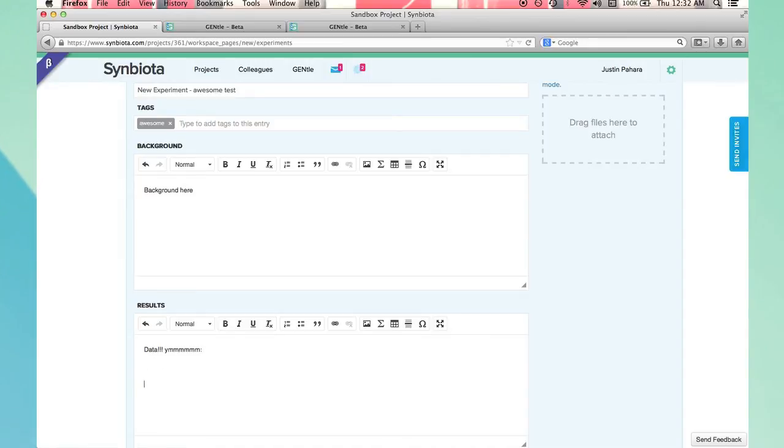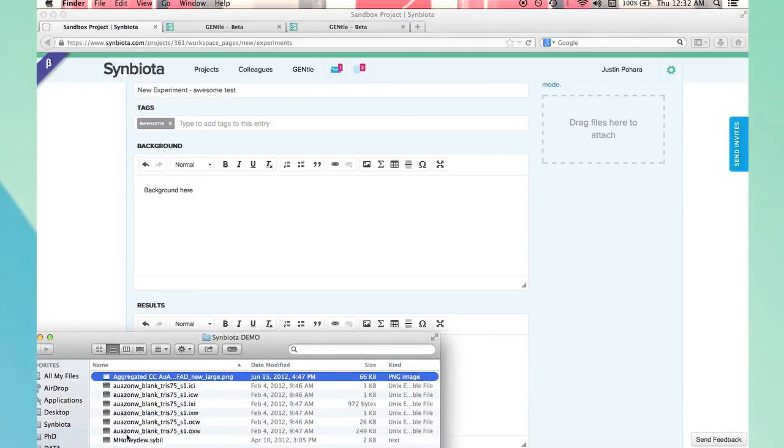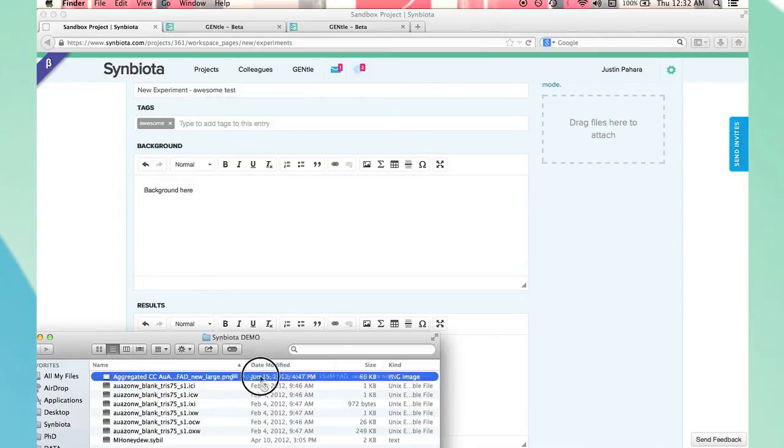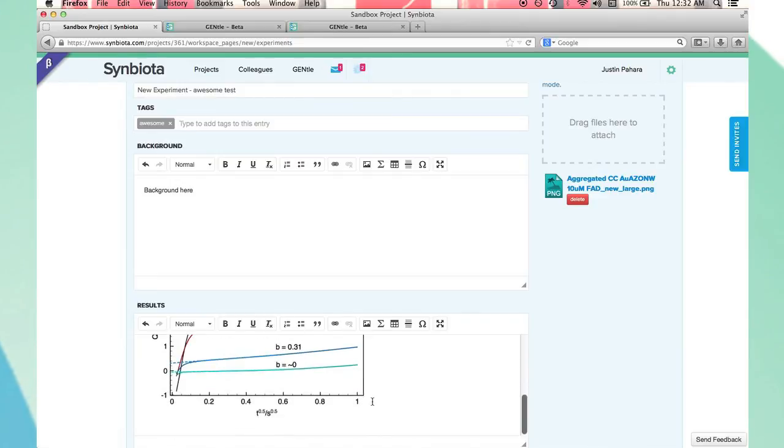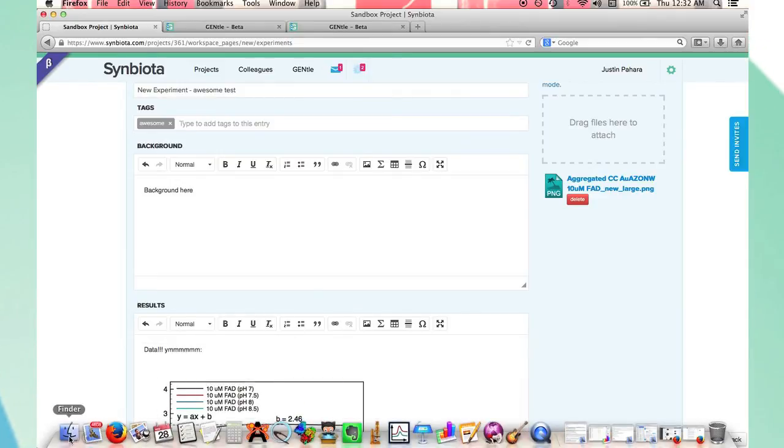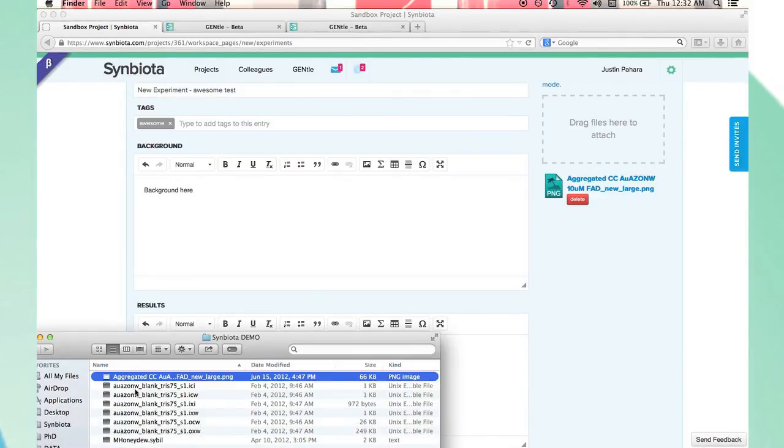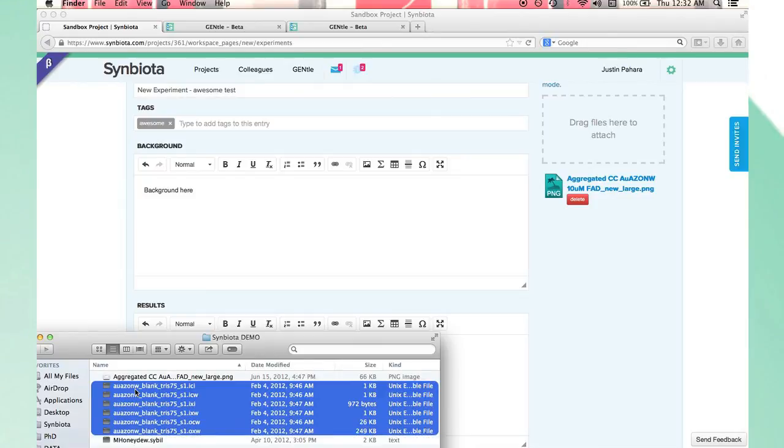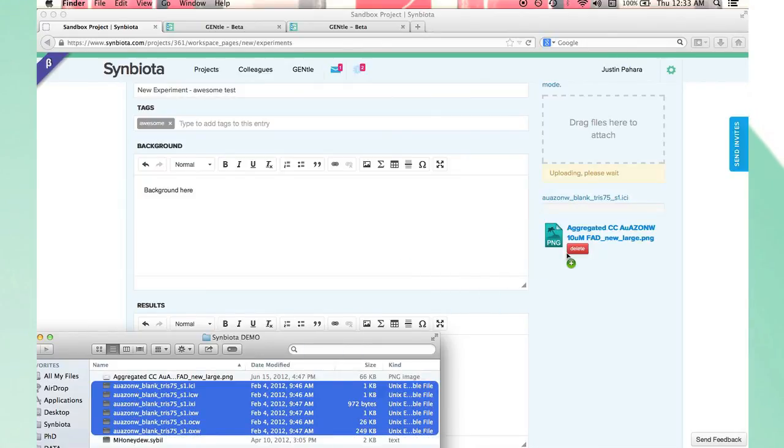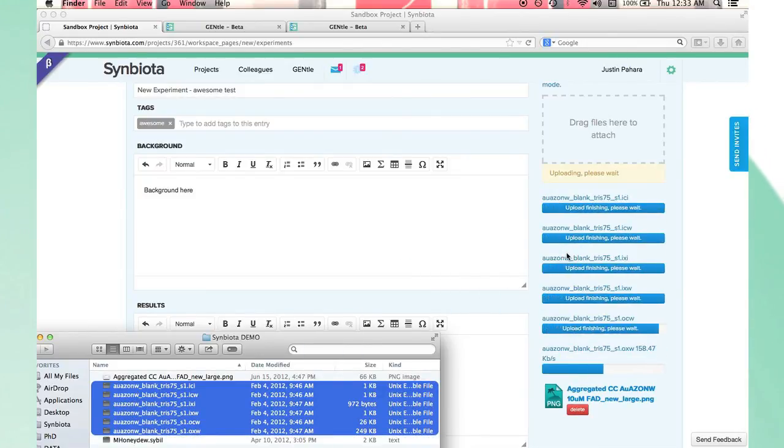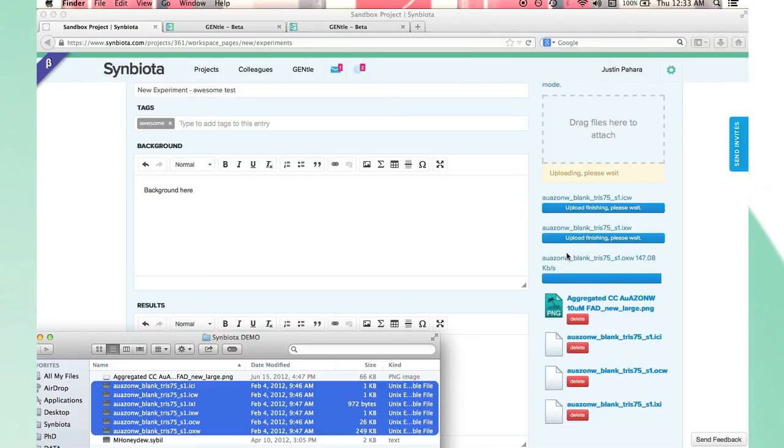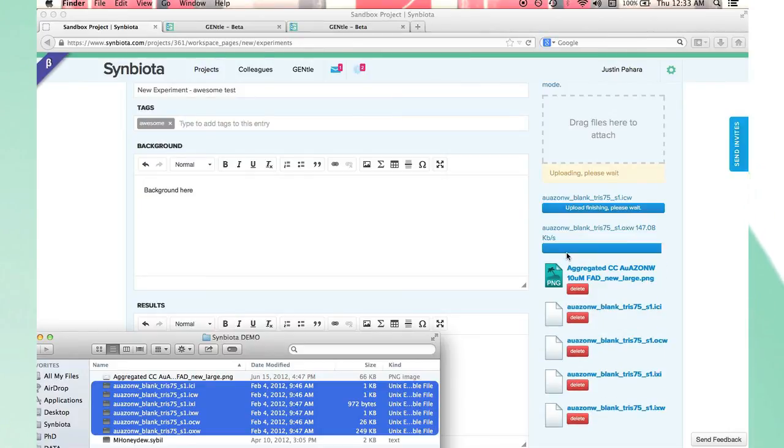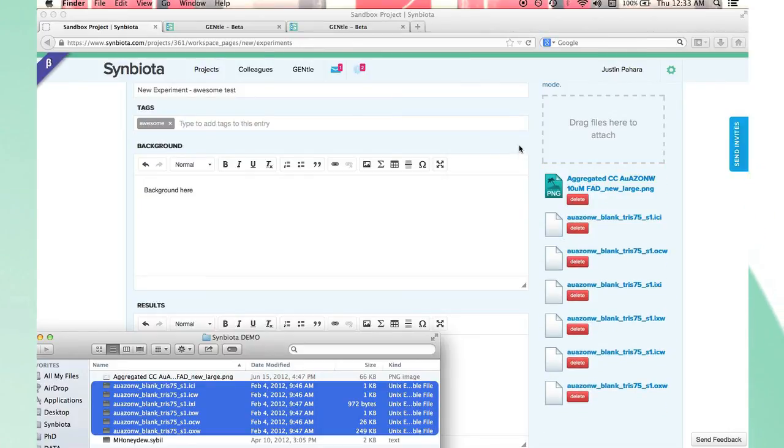I can drag and drop data, images, movies, all directly into the text box, or I can drop them in the side column. When I'm finished, I click save and close.